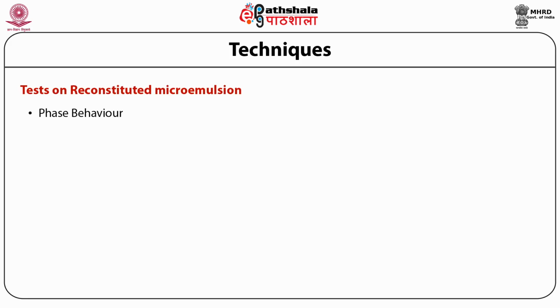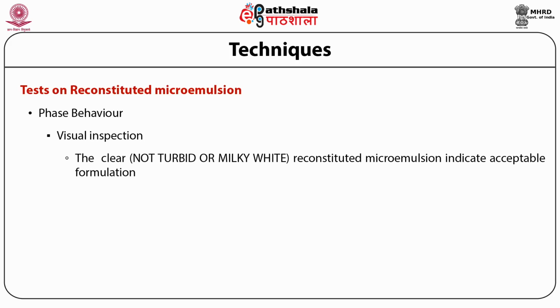The phase behavior study is conducted using visual inspection for the clarity of a microemulsion. A clear, not turbid or milky white, reconstituted microemulsion indicates an acceptable formulation.